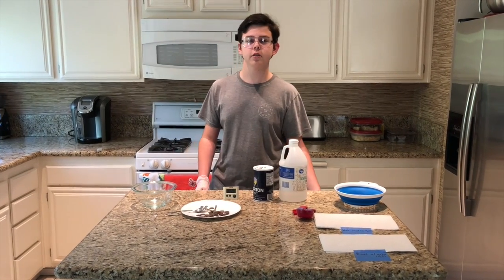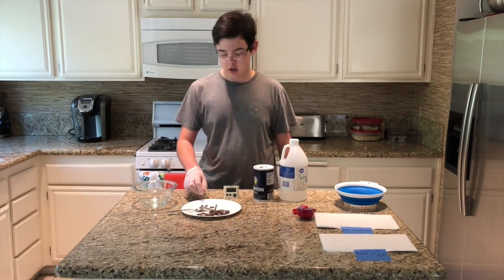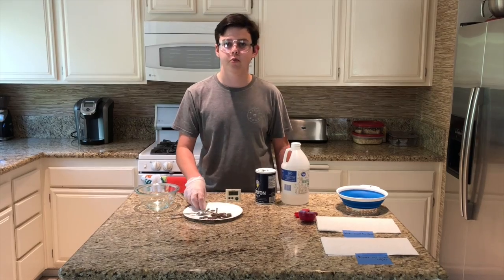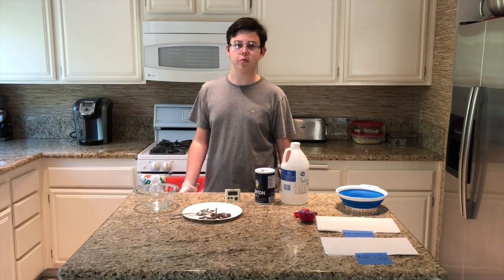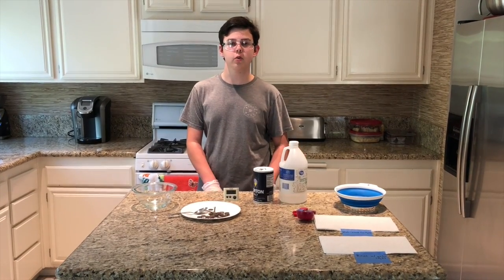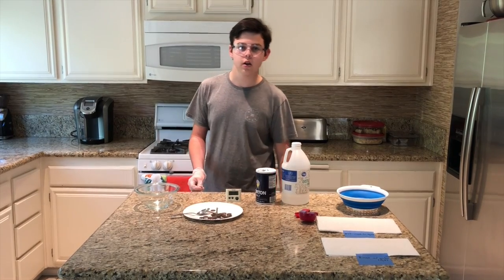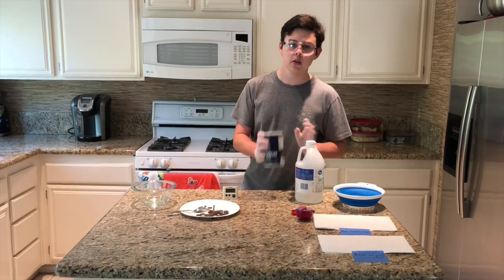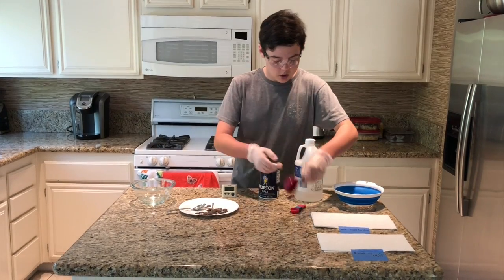Bennett, and for my practical online final, I chose to do the lab about the properties of metals using pennies. So the purpose of this lab is to learn more about the properties of metals, while also correlating it with a real-life issue. So the materials I need for this lab are vinegar, salt, a couple of measuring cups.